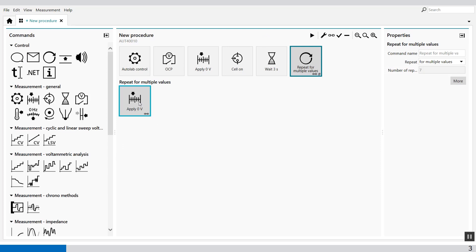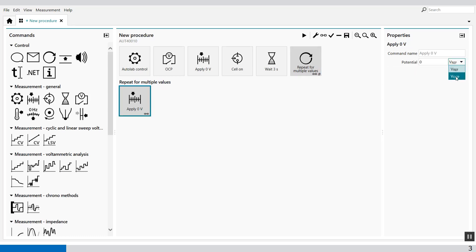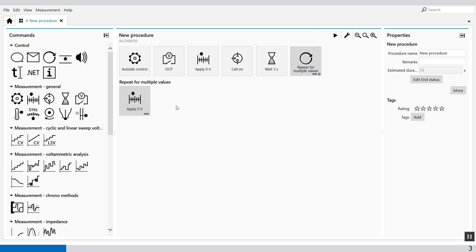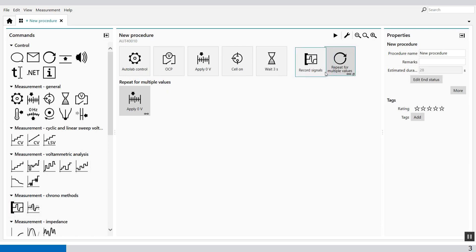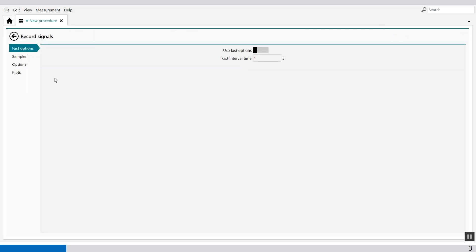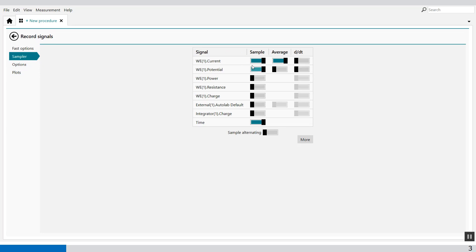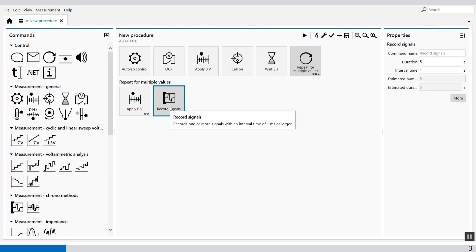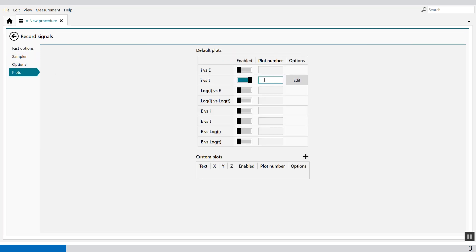Then we use record signals after the applied potential — this is with respect to OCP. We drag and drop record signals into the Repeat Loop. We measure the following signals: current, potential, and power. We also set the plots: I versus T is plot number 1, E versus T is plot number 2. The current is made red and the potential blue. Power versus time is plot number 3, displayed in green.